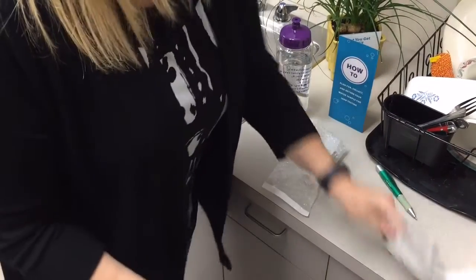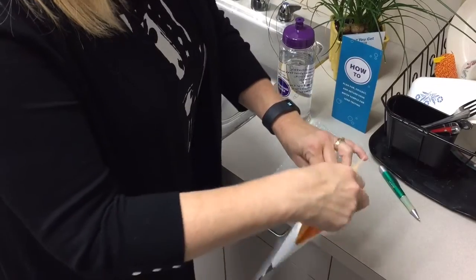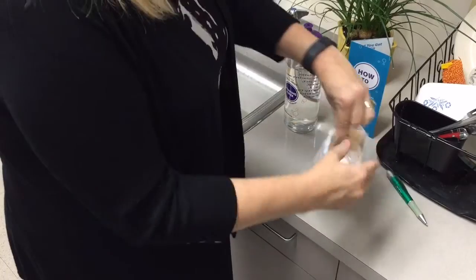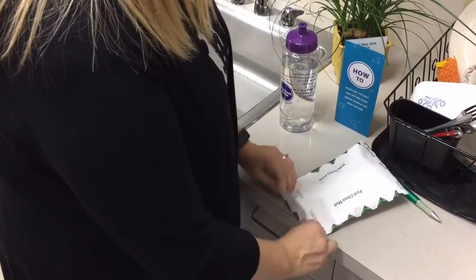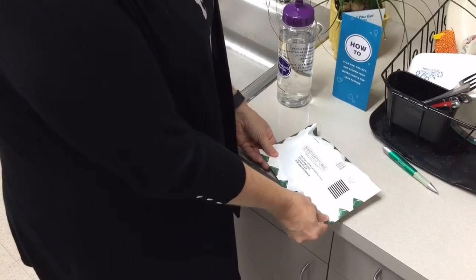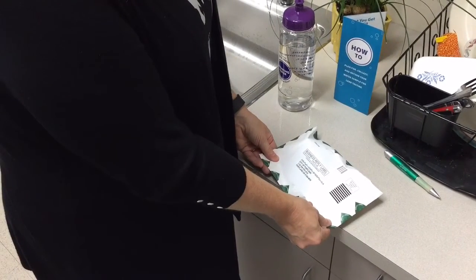Place the sealed bubble lined bag and the completed info card inside the 6x9 postage paid return envelope. Seal this envelope with a self adhesive strip and return the sample to the lab within 7 days of collecting. You should receive your results within 4 weeks.